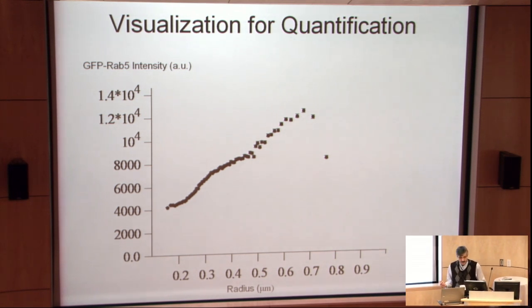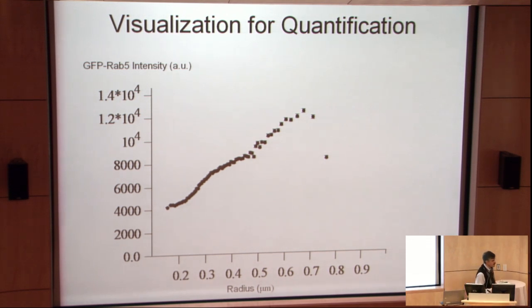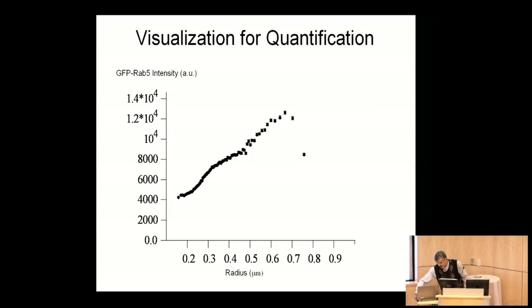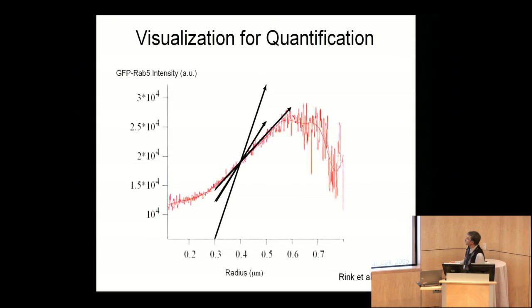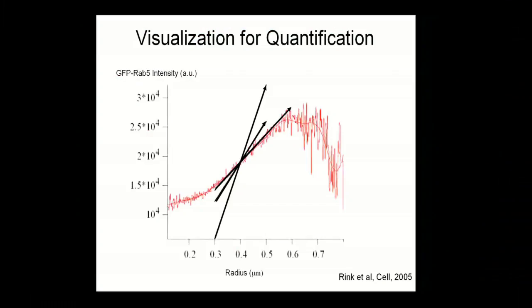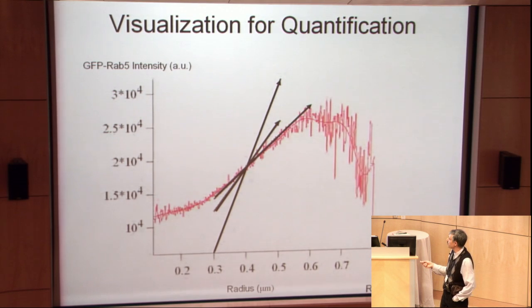But what does it mean? On top of this, if I take the time-lapse movie and see how the individual endosome progresses, and add time information, which here I draw by lines to show the direction of time development, different experiments provide different slopes, and then I average the experiments. This is the paper that was published in 2005. Then I understand that in reality the Rab5 endosomes progress from small, dim ones to big and bright ones, and then there is a collapse.